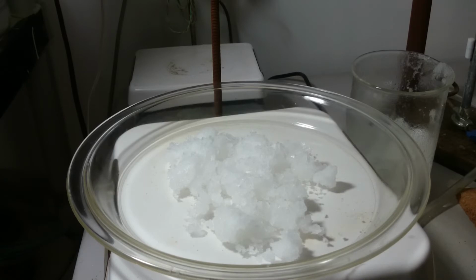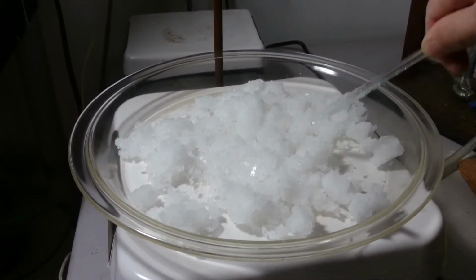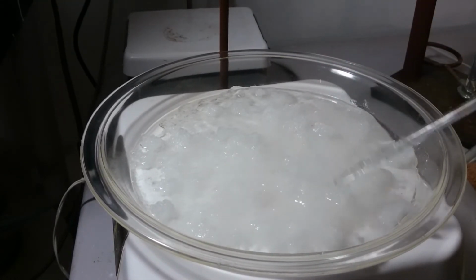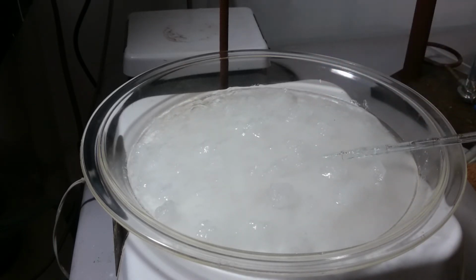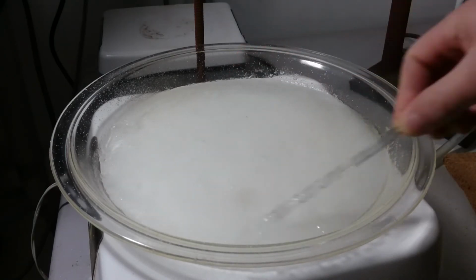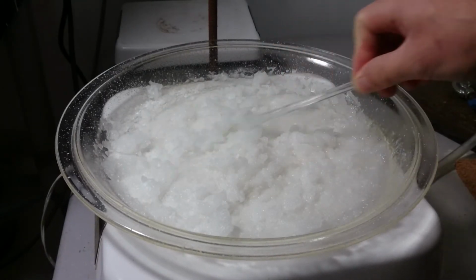Once we've recovered all of our product in crystal form, it still contains quite a bit of water. In fact, I think this is a hydrate salt. I couldn't find a lot of information about what sort of hydrates sodium propionate forms, but it needs to be heated and the water needs to be driven off. So I add everything to a drying dish under gentle heat and drive off the water.